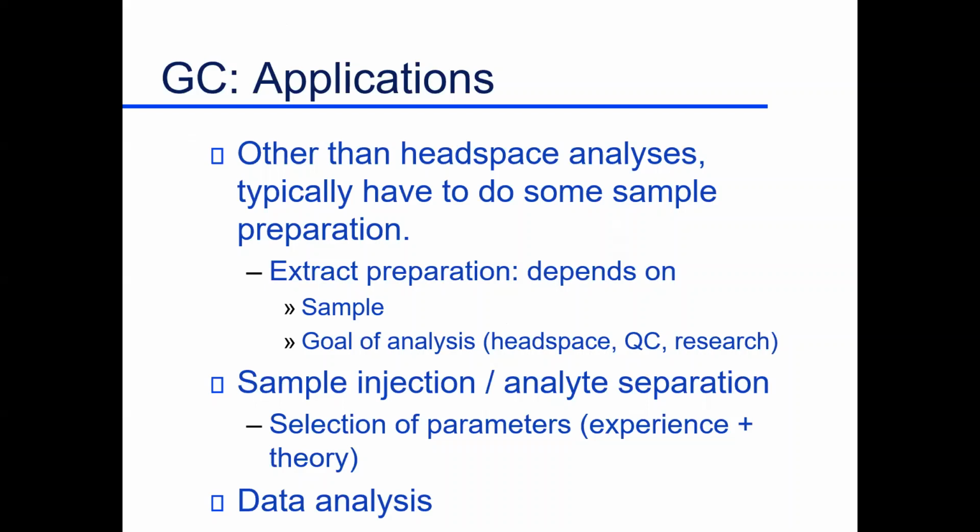Then I'll spend the rest of the time we have today on applications. So I have roughly 20 minutes to look at that. We basically have to do some kind of isolation, some kind of sample prep. We want to look at the flavor of a nice Haralson apple, or to pick a different variety. You can't stuff the apple in the machine. It wouldn't work very well. So we've got to do some sample preparation. And that really does depend upon what the product is.